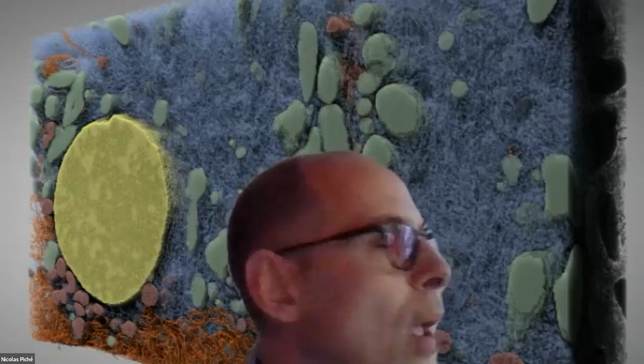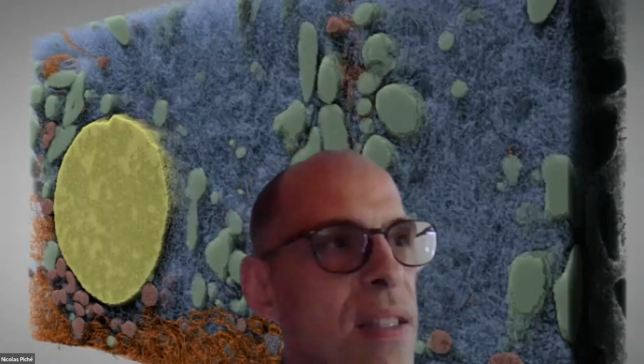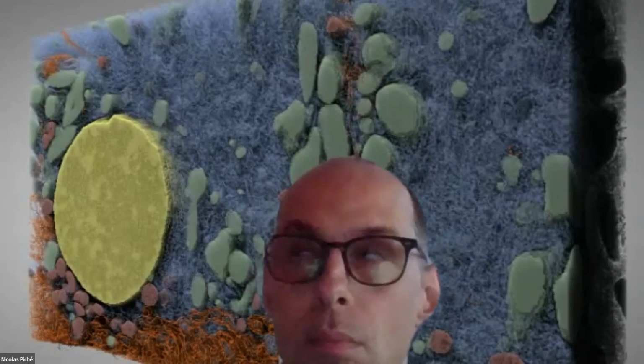So you see here in the background an example of a segmentation, which is a FIB-SEM of a retina cell. As you see, it's totally segmented: nucleus, mitochondria, ER, and some processes. There were, I think, 11 types of organelles segmented. It's an image from DC Lab in the US.